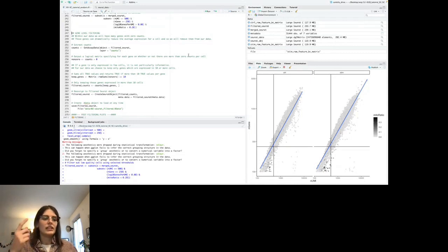expressed in only one cell, okay, after, when we do the statistics, we perform many tests that actually are not useful because we have information on that gene in only one cell, okay? So it kills the statistics with the correction, okay? So we can decide to keep transcripts that are expressed in at least a number of cells.